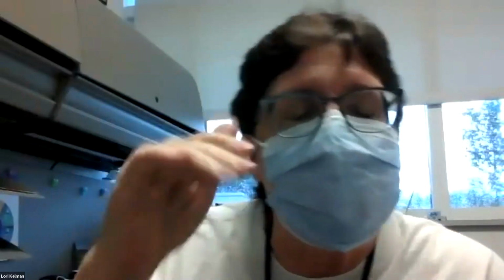Do you know what the MIQE guidelines are? I am passingly familiar with them. For publication, MIQE, and I forget what it stands for right now, but it's the minimum acceptable standards at the bench, at the design phase, at the execution phase for qPCR to be published.